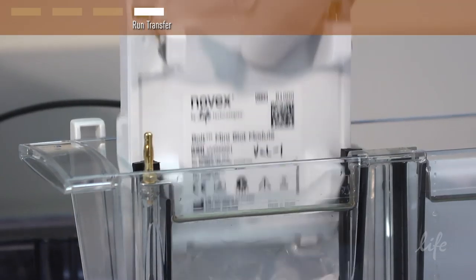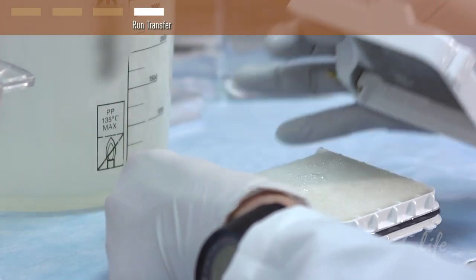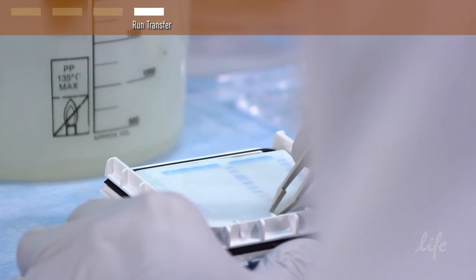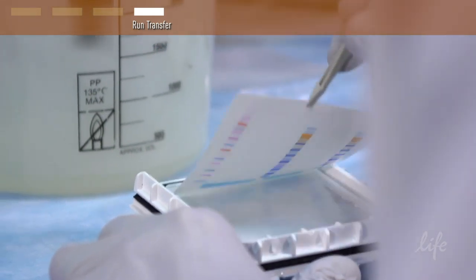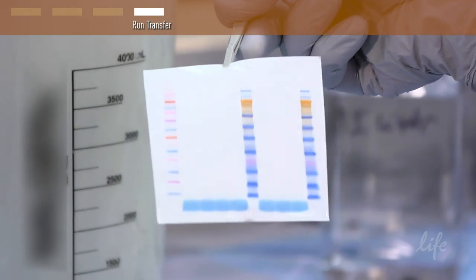After the transfer is complete, remove the module, pour out buffer, and disassemble the module. Recover the membrane using tweezers. As you can see, the transfer looks great. You are now ready to probe your membrane for Western analysis.